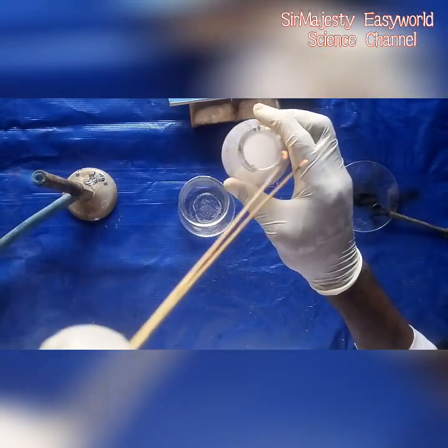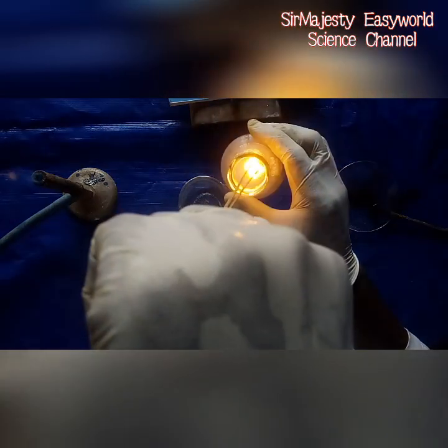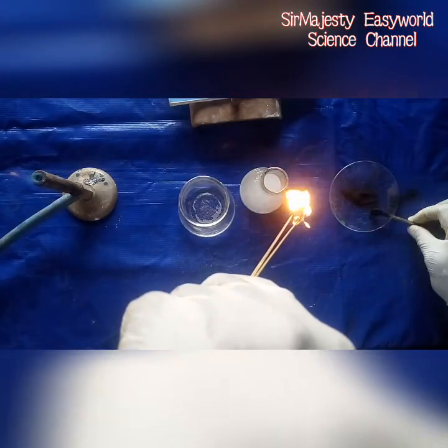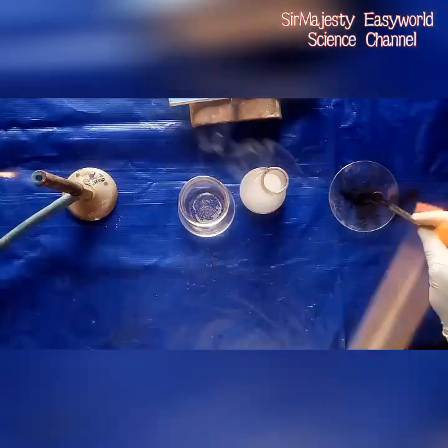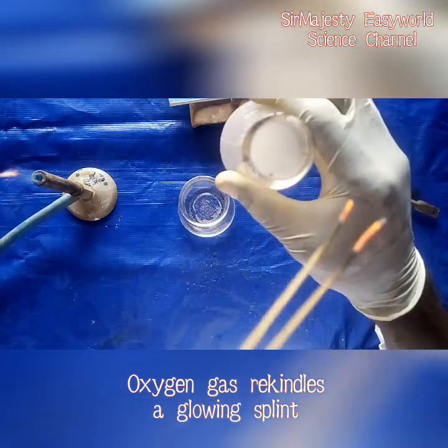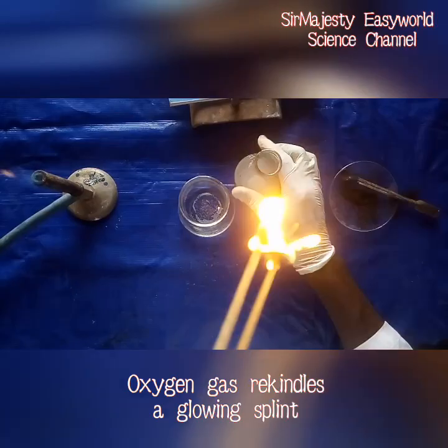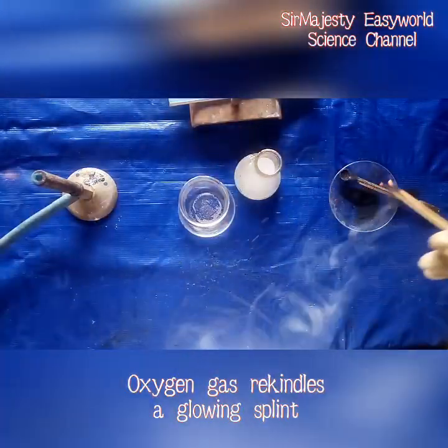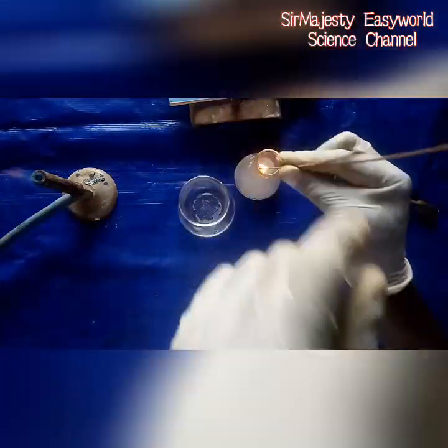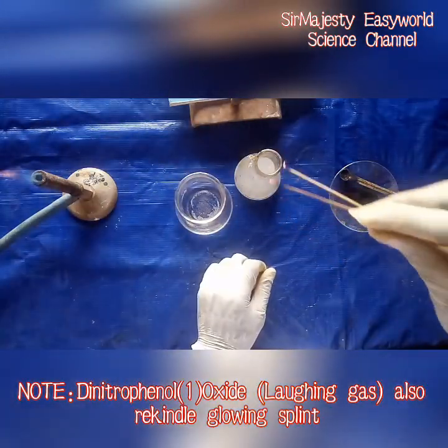Again — so it can do a glowing splint test. Even when I extinguish it like this and take it back to rekindle, it lights up again. Get it off, take it back here — it comes back again. That's wonderful!